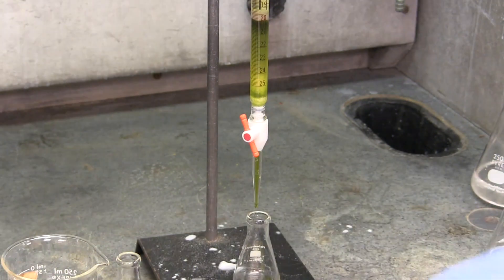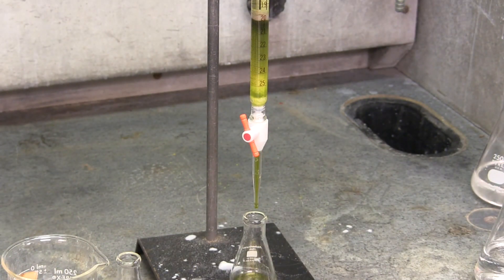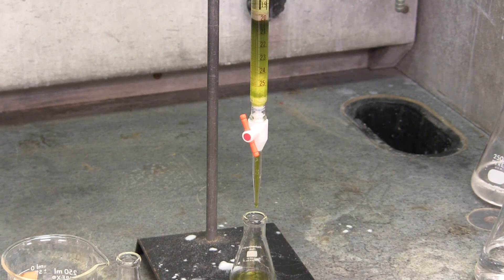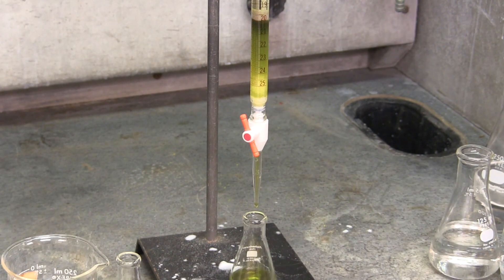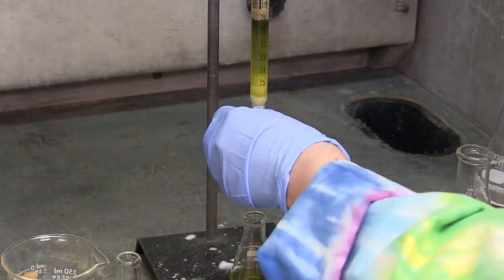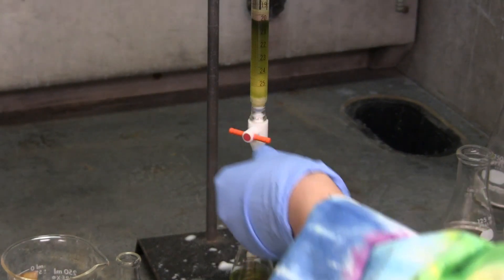The last fraction collected in a new Erlenmeyer flask is the lighter green band. Once this last band is collected, the column is stopped by using the stopcock.